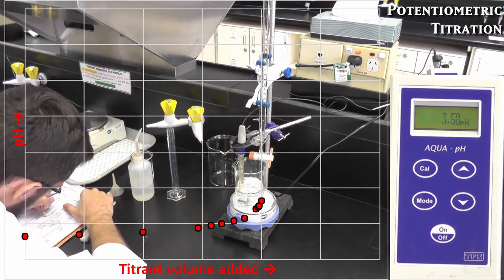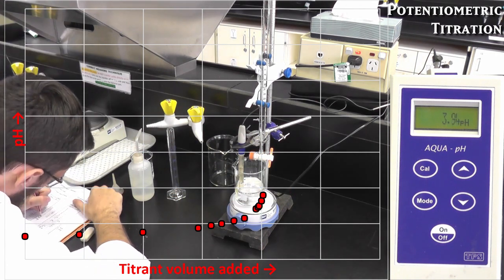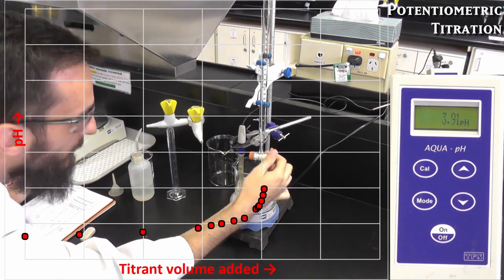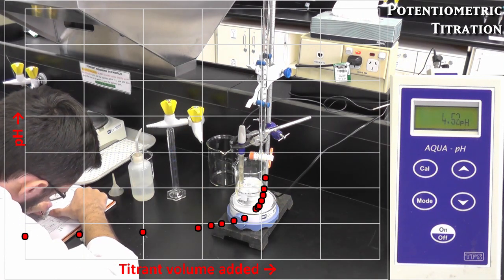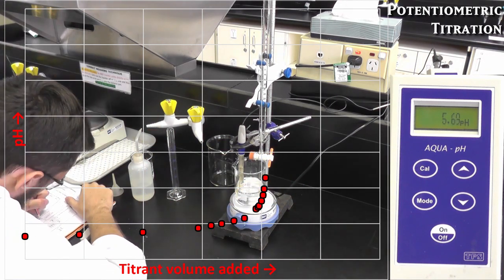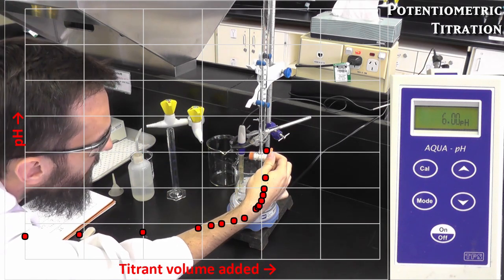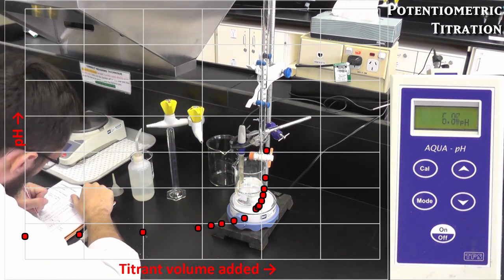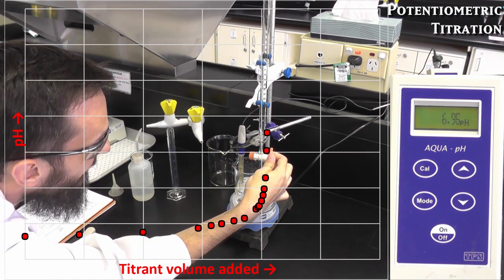It should be mentioned that the pH meter must be allowed a few seconds after each addition of titrant before reading a measurement. This is to give the solution time to mix and react properly to produce a more representative pH reading. A pause after each addition somewhere in the order of 3 to 5 seconds is sufficient. There. The small additions of titrant have yielded very large spikes in the pH readings. Once completed, the middle of this near vertical portion of the graph will be the equivalence point.